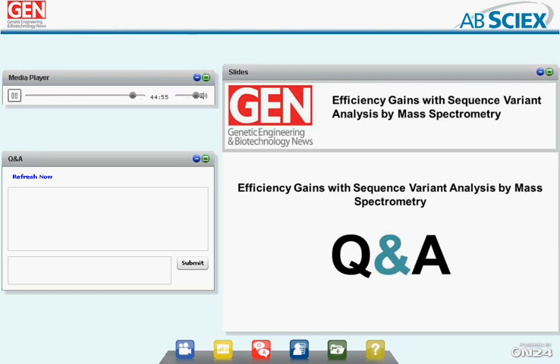So the benefit of decoy databases in your searches is it gives your scoring algorithms more false hits to look at, and it allows you to refine a lot of your answers by giving it a more statistical probability of being correct. We use decoy databases commonly when doing high throughput protein identification experiments.